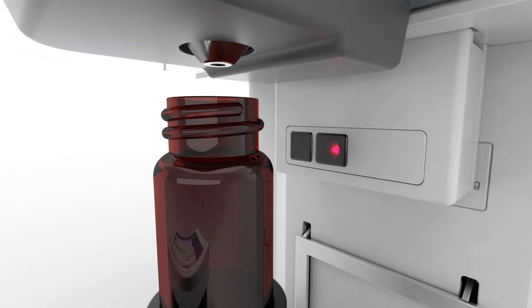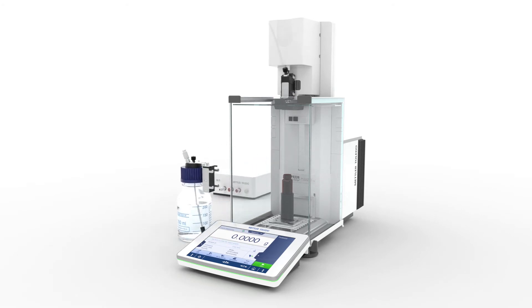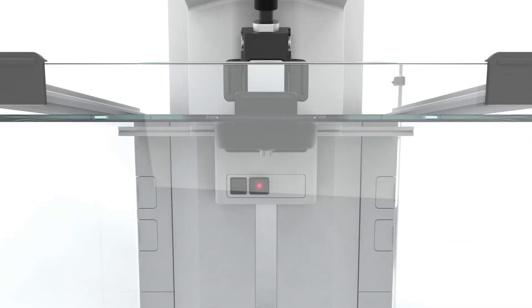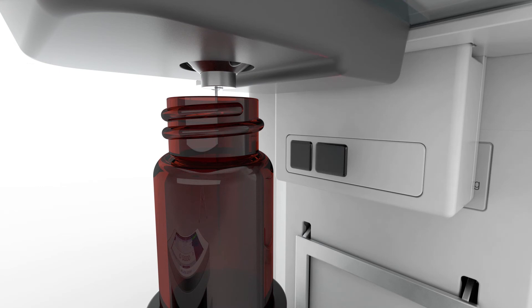If you want to weigh manually, with just one click the dosing unit moves up to the top position and you can use your balance as normal. And if you need to prepare perfect concentrations, no problem — you simply define the concentration and the balance automatically adds the solvent. Imagine you had a coffee machine that automatically added just the right amount of milk and sugar.